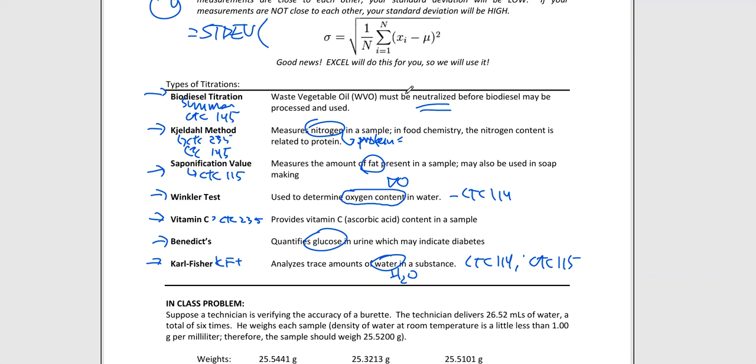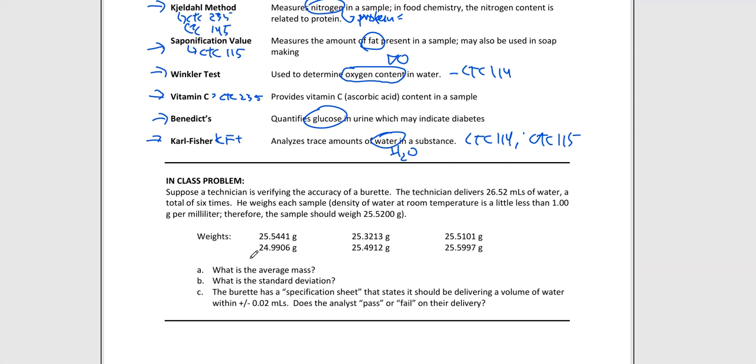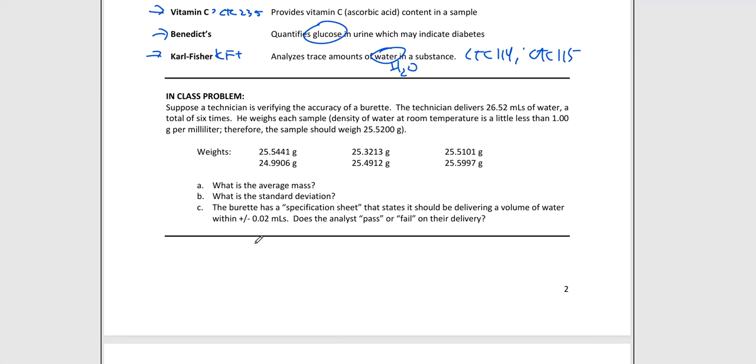All right, so all of these are examples, absolutely. And more importantly, most of these examples you're going to be doing yourself in a working laboratory. And that's our lab. Oh, we're so excited.